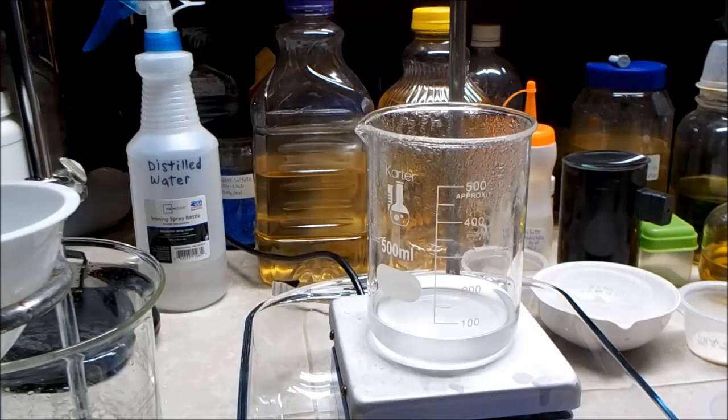I'll let it cool down and hopefully it'll all stay in solution — if not I'll have to add more water. I can say for sure that whatever it is, it's not potassium carbonate, because I happen to know that's very soluble and easily dissolved in water. So this is something else.